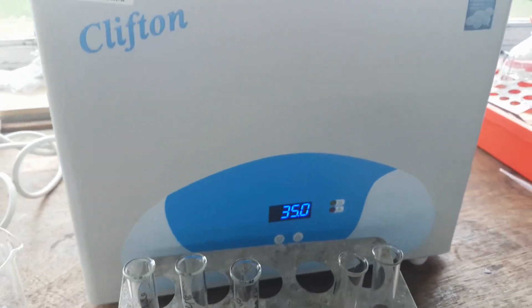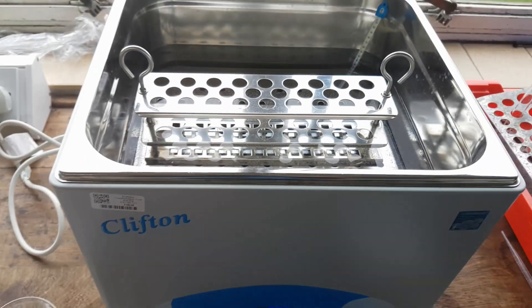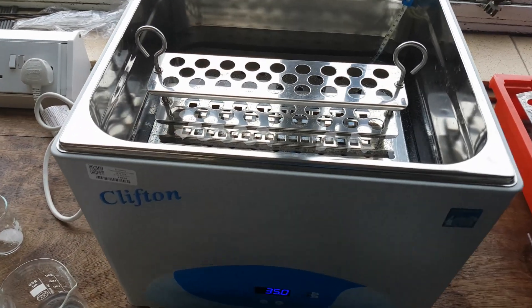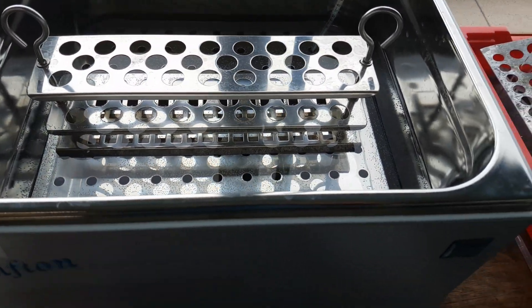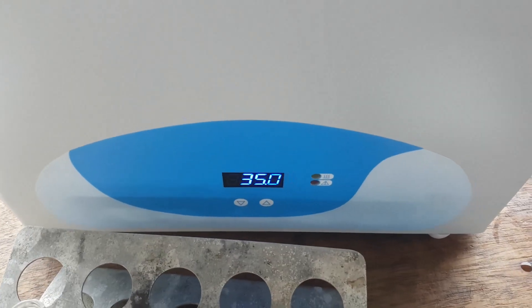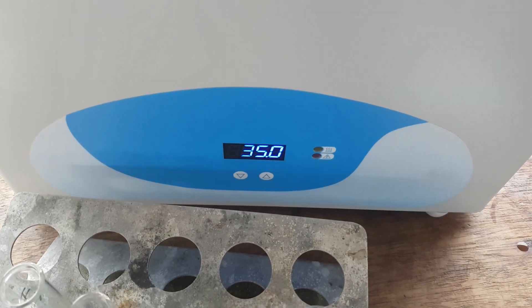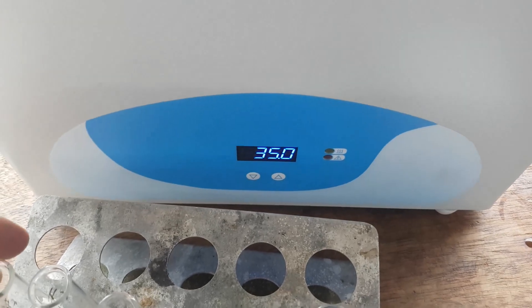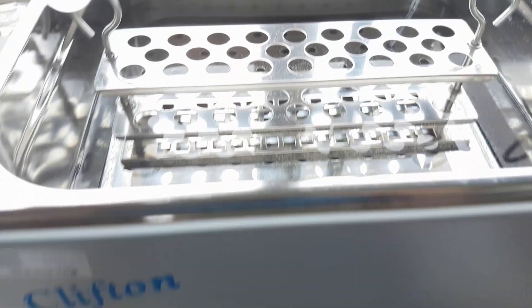And now I'm going to use this bad boy here, which I can't believe I didn't know we had, which is wicked. And what I'm going to do, this is a water bath. This is keeping us at a stable, constant, 35 degrees Celsius, which means we are controlling the temperature as well. So this is another control variable. We are keeping it the same.